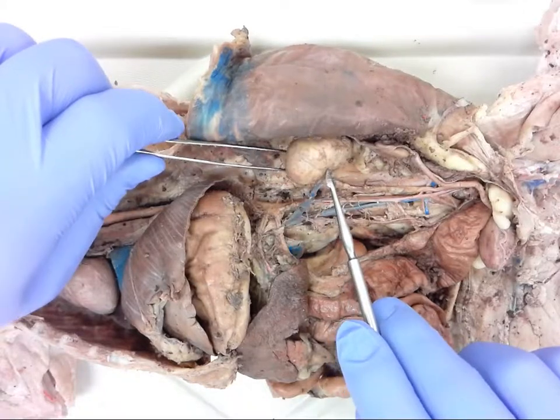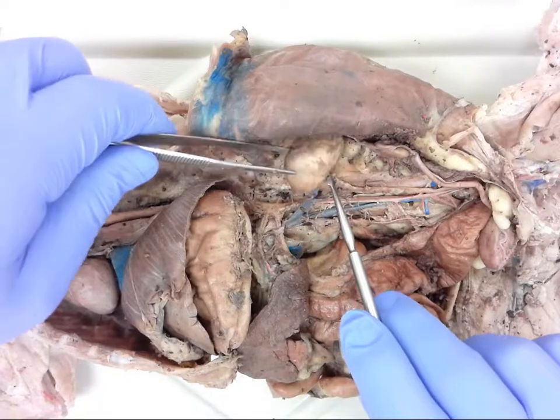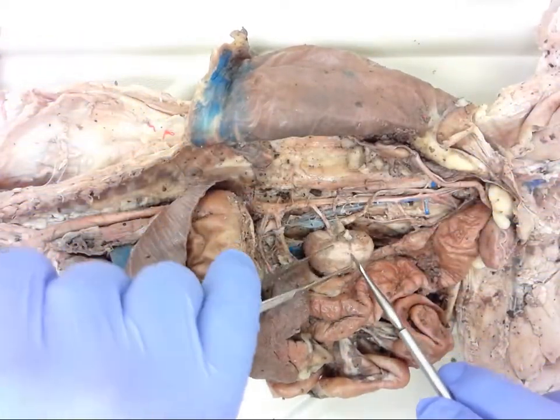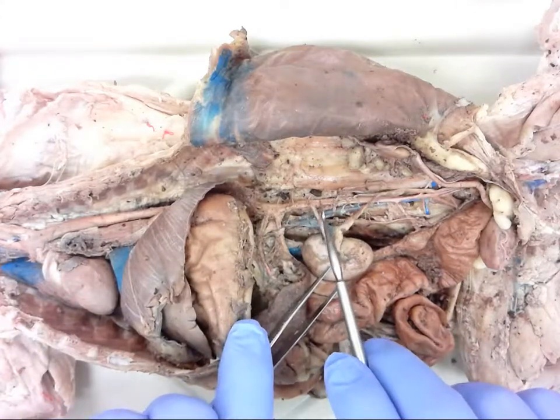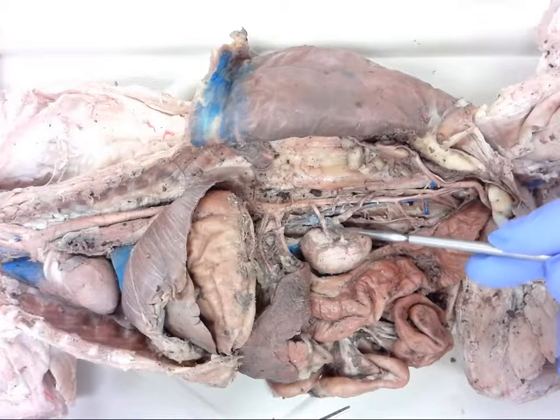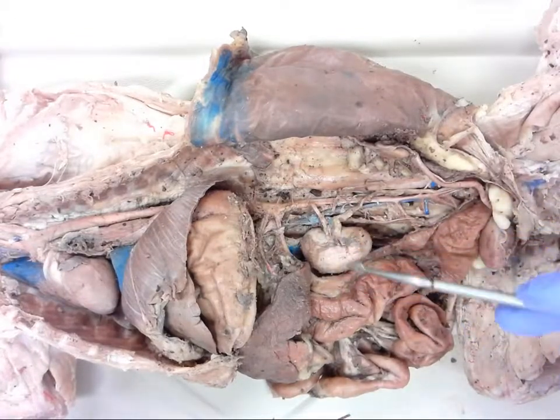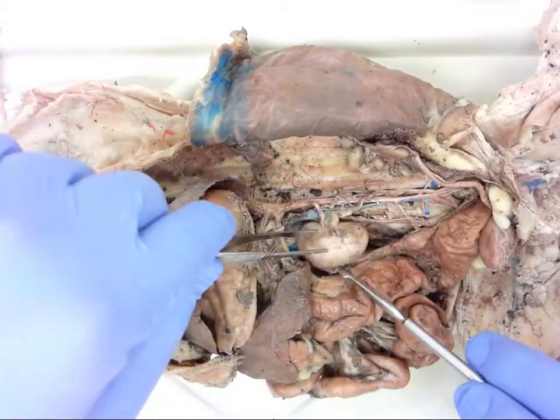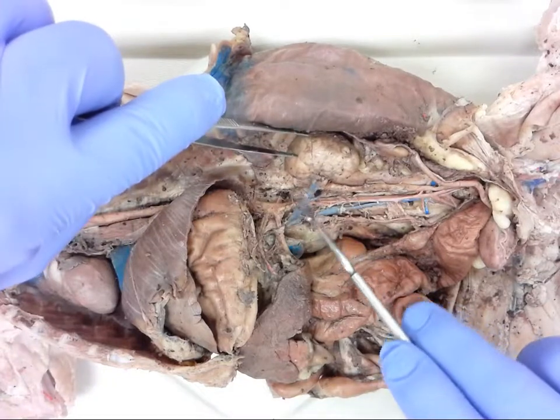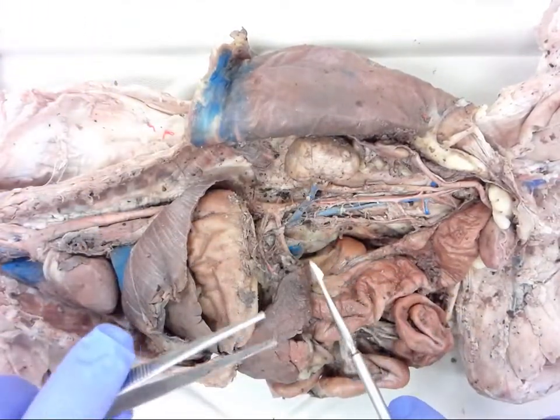But if we were to flip this over, this is the kidney, so you can see that this has been pulled out from the abdominal wall. If we were actually to flip it over, you will see very well the renal artery. So the renal artery comes off of that aorta, goes into the kidney, gets filtered out, comes back out through the renal vein. So we'll flip it back over, and here is your renal vein. Renal vein is fairly easy to find. It's a little bit bigger and usually filled with latex a little better.